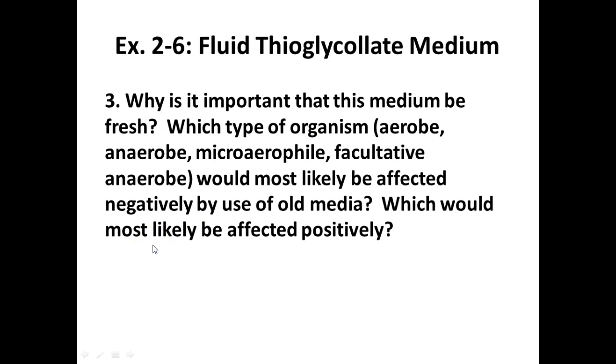So why is it important that the media be fresh? What happens over time? That oxygen is going to diffuse down, right? So which type of organism would most likely be negatively affected by old media having a lot of oxygen in it? The anaerobes, right? So our anaerobe would have very little space to grow, right?